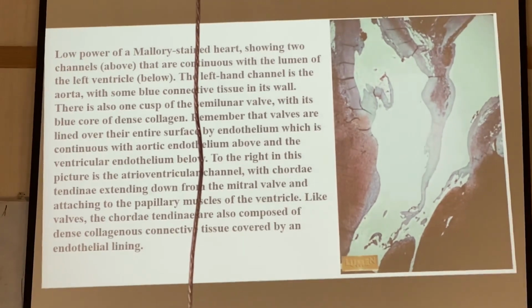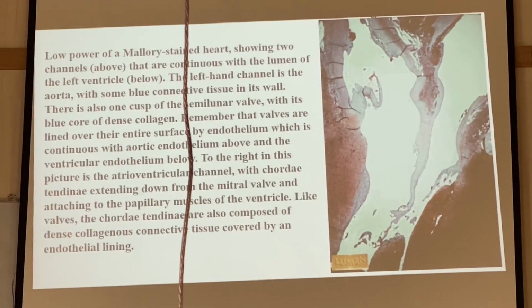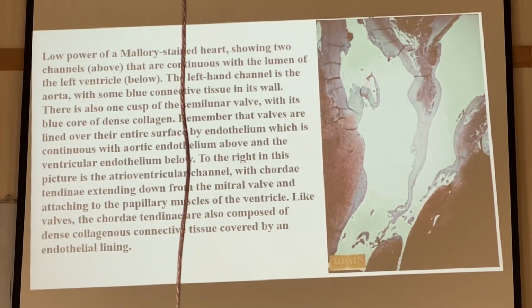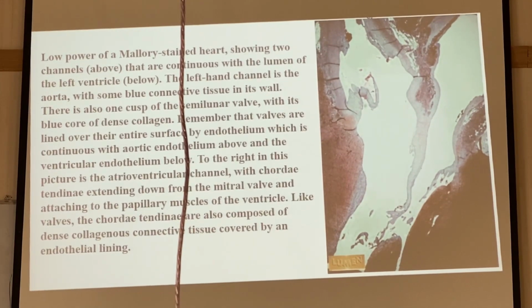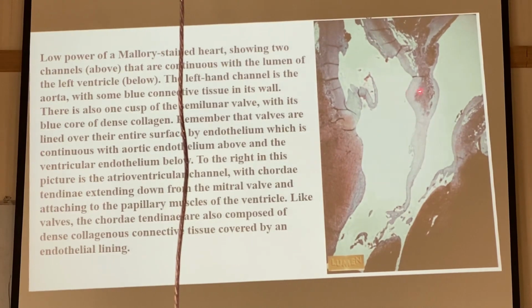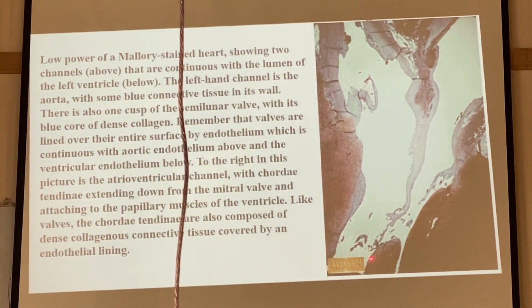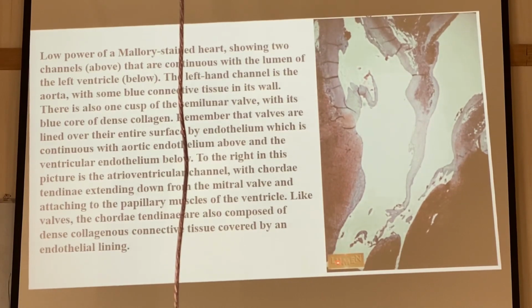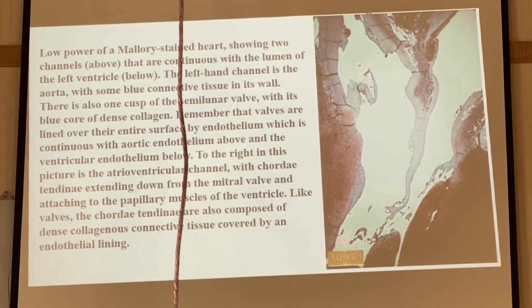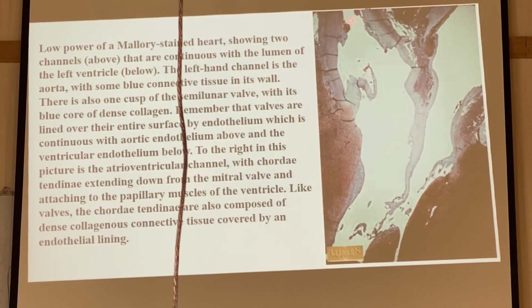Now, this is a lower power of a section in the heart. In this case, the left-hand channel, this one, is the aorta. So this is the papillary muscle, and this is the ventricular cavity, and this is the area where it leads to the aorta.